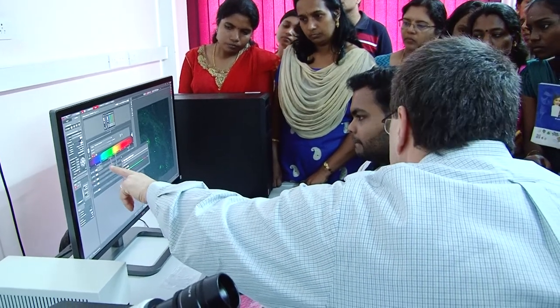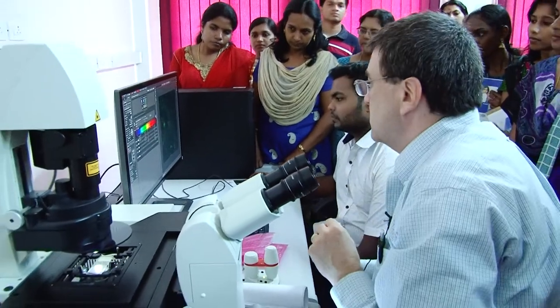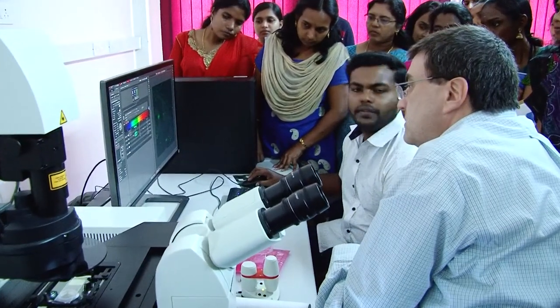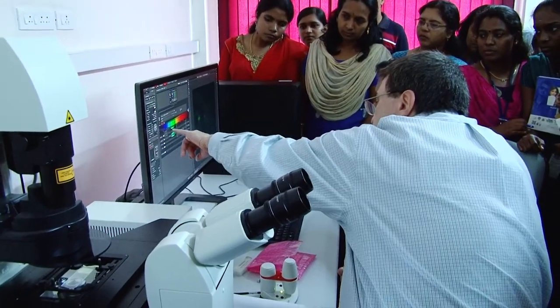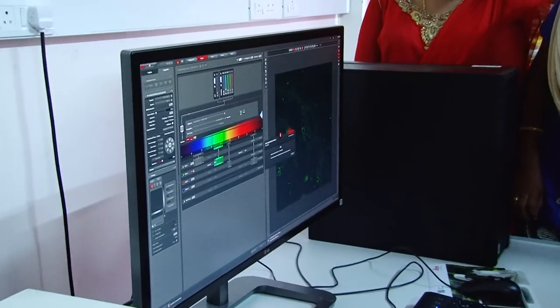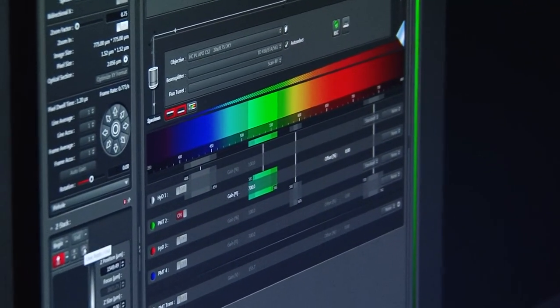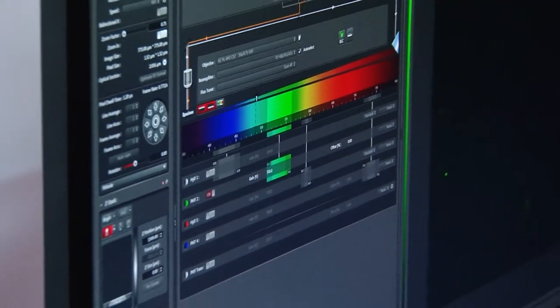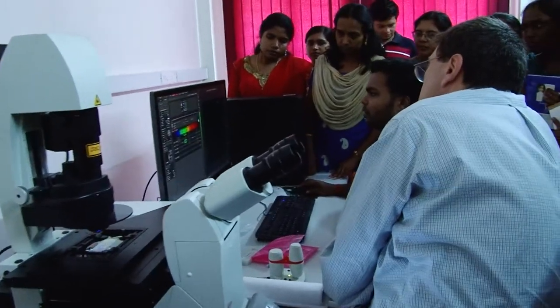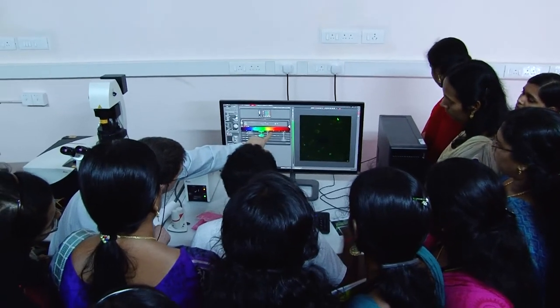So what he's going to set up here, you're just going with the regular green. I'm going to try just green. I haven't looked at these in a long time, I sort of forget. But yeah, just set up a green and take a look, see how it looks with the confocal. Go down around in here, somewhere in there, and then try the 488. Let's see what we got. And then, can you do red also? Can you do red at the same time? Okay, so we're also going to do red. I want to use the 561 laser, and then we want to collect maybe around 600 or something. Yeah, exactly.